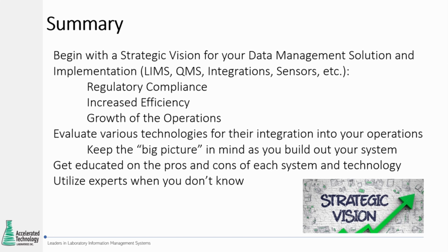of each, and also keep the big picture in mind as the system is built out, and keep in mind everything that you can do. And it's not critical to do everything at once. Most of the successful deployments use the phased approach where they have a roadmap and they know what they're going to attack at each phase.